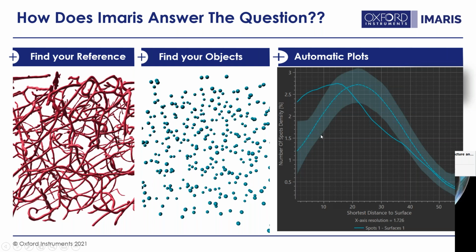And so we can say for sure that what we saw in the observed, or your original image, there's definitely more of an attraction, or more spots found from 0 to like 18 microns than we see in the simulation, in the random distribution. You can also see that because of the shift to attraction in the lower distance values, we have a shift to repulsion, where we're underneath the curve.